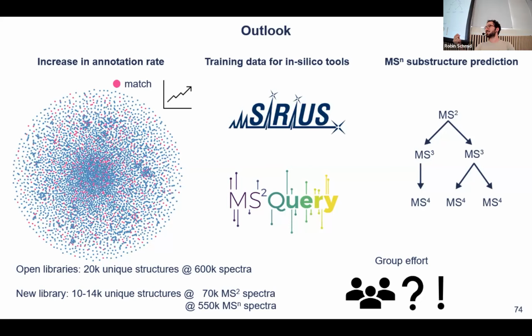So even mass spectra that do not have much metadata can be useful for people to train machine learning models and understand and make sense of mass spectra in general. So they can generalize from that idea. So we can see what comes up in the future.